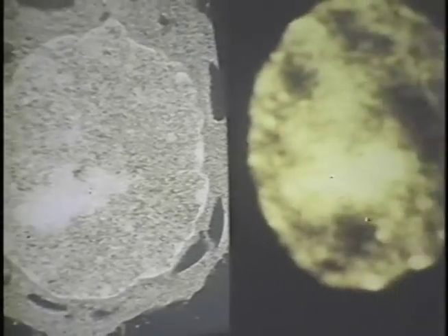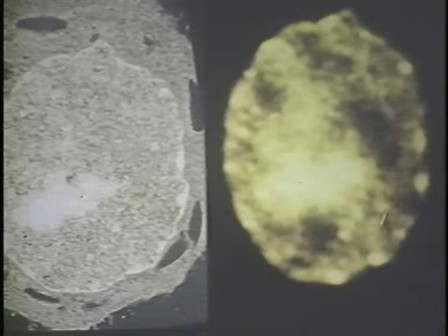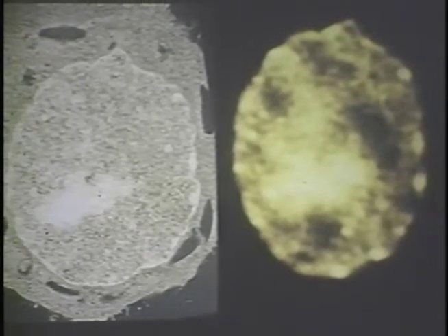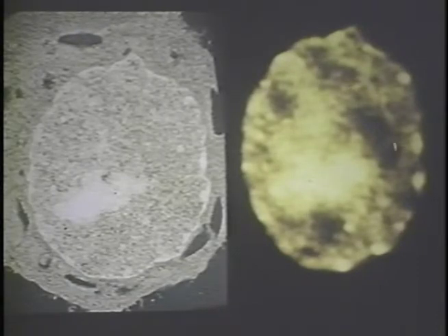By staining this section with a dye which is specific for DNA alone, what we see is a very different appearance. This is a light microscope image now, so the resolution is lower. What we see is very widely differentiated staining here. There are regions which look quite uniform, which are obviously not containing very much DNA, and we see much more of a thready appearance to all of this.